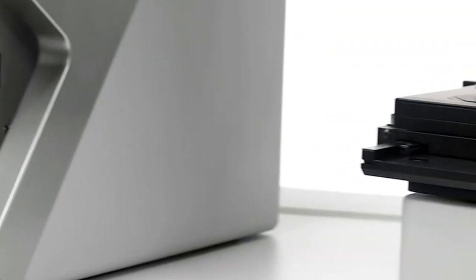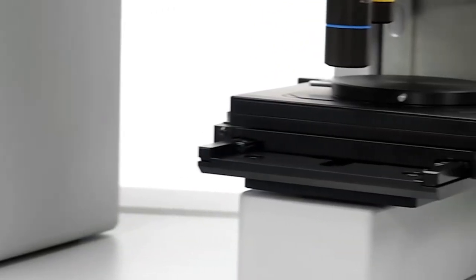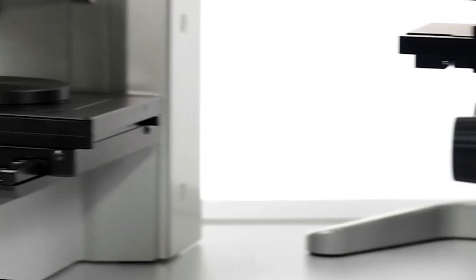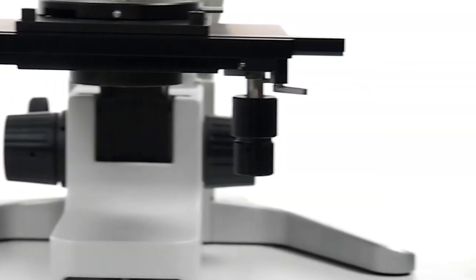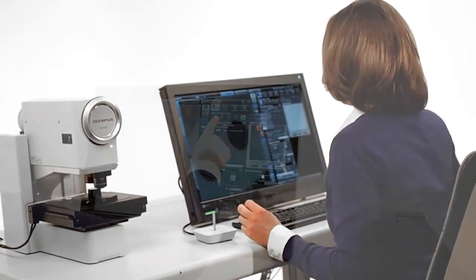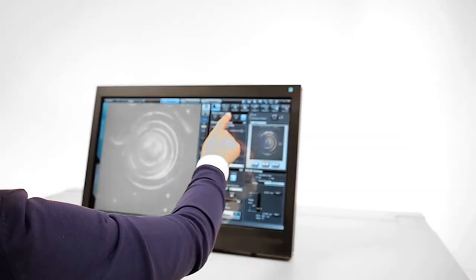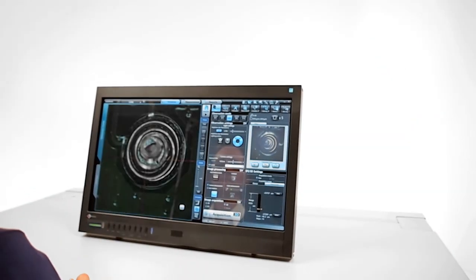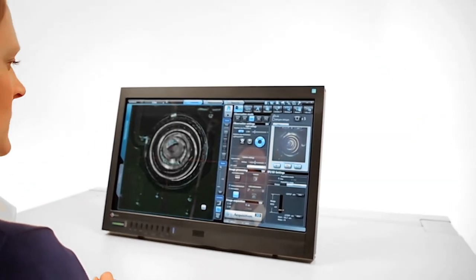DSX series instruments are built on sturdy frames with a low center of gravity. Comprehensive vibration compensation ensures a stable environment for observation, measurement, and 3D imaging.